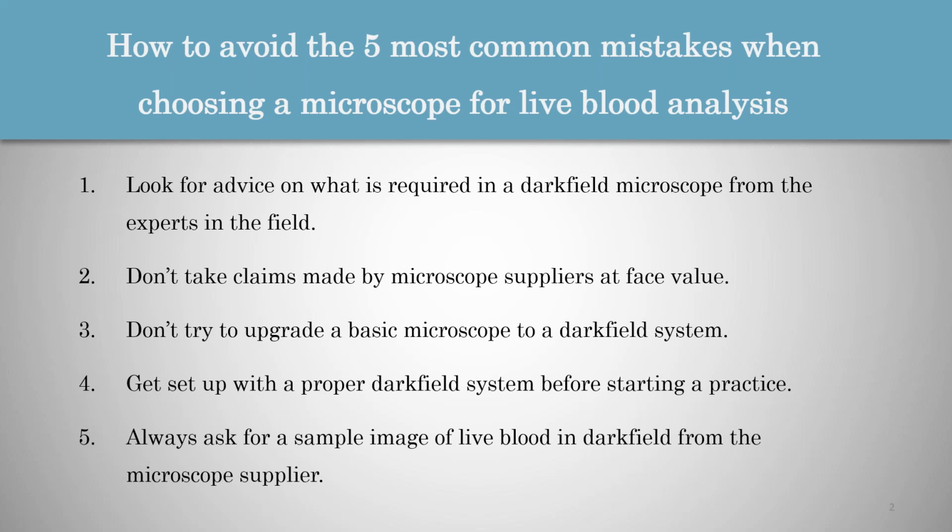Okay, thank you. And Nikati is saying, I have a phase contrast microscope. Will it be okay? Yeah, it will allow you to see some of the anomalies that are visible in dark field, but not all of the dark field anomalies. Unfortunately, phase contrast does sort of bridge the gap somehow between bright field and dark field, but there are many dark field anomalies that are only visible in a good professional dark field system.